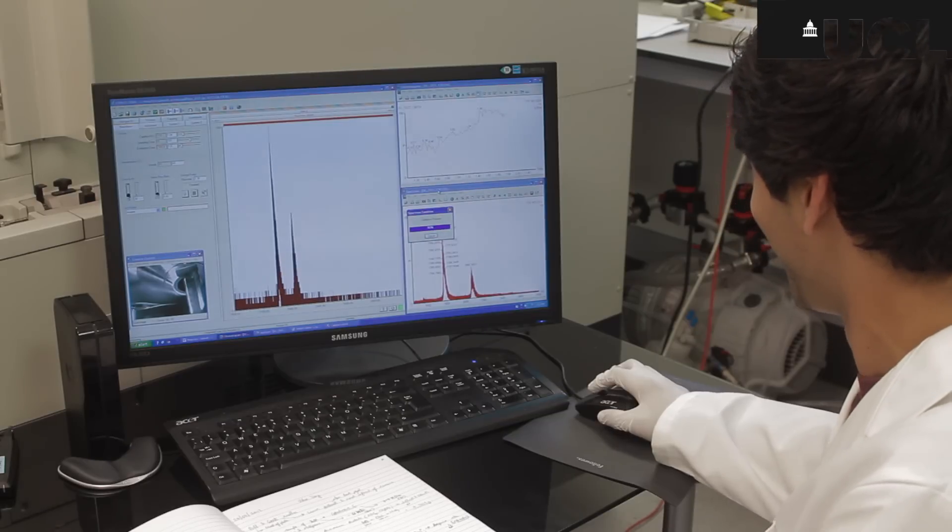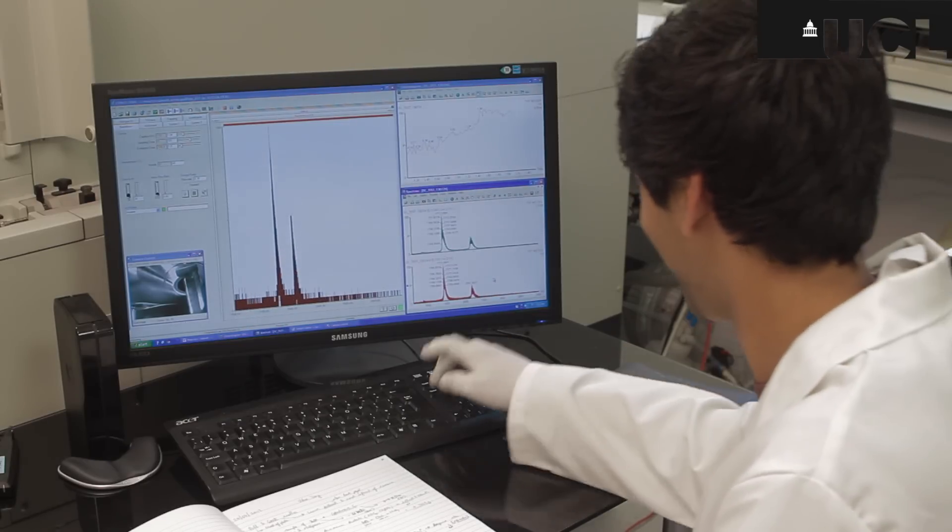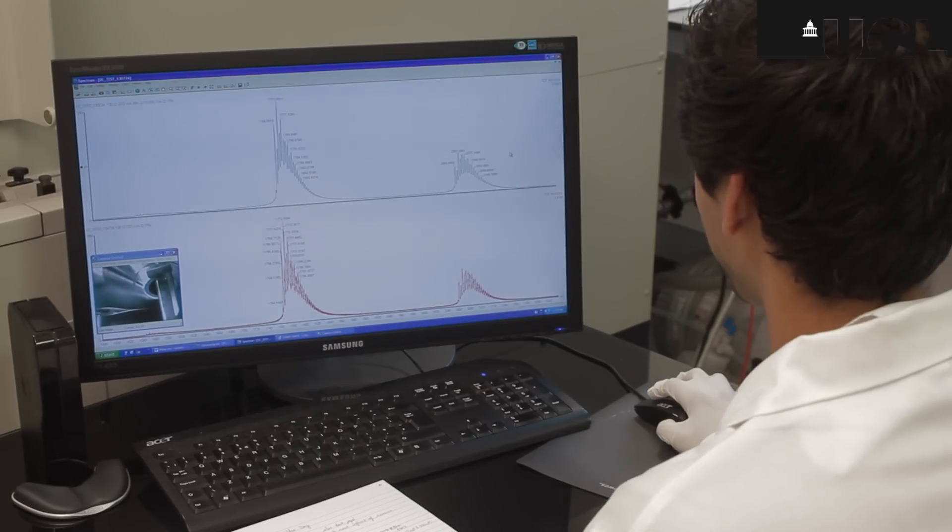The data is now being processed and smoothed which can then be analyzed. And here we have a final result.